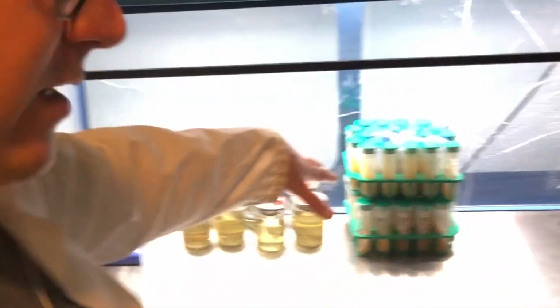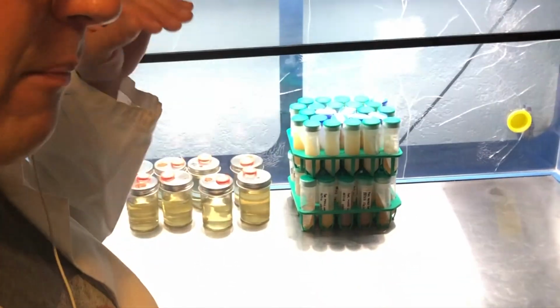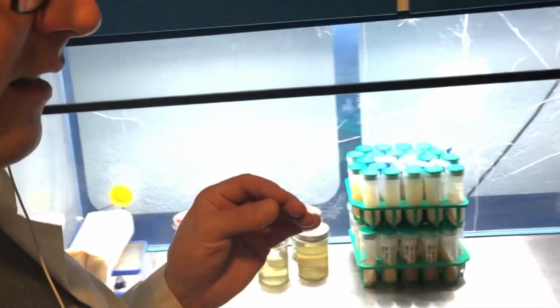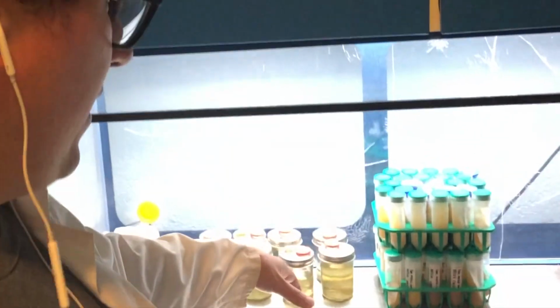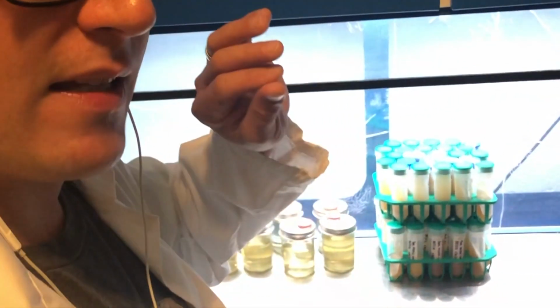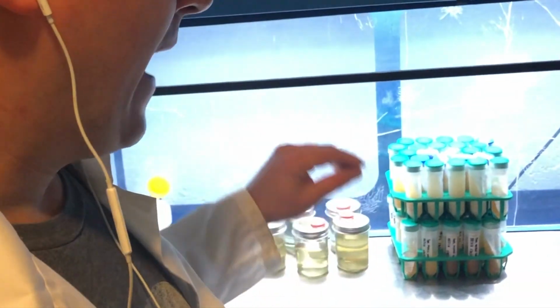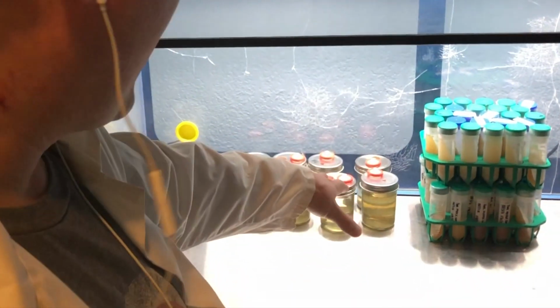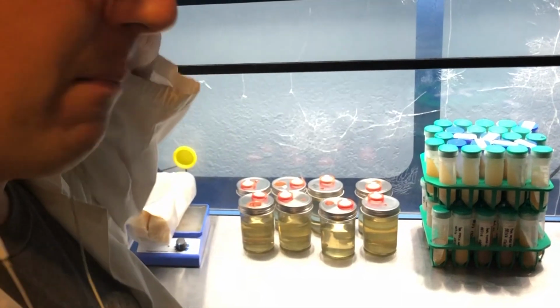This kind of goes against what I usually say, because normally I would pour my plates before I work with sterile tissue, because that's the cleanest process first. But this is the end of last week, so I'm going to finish this up, and after I'm done with this process, I'm going to really clean out my hood, and then I'll be pouring my plates. So I'll go through my inoculations using my slant cultures over here, and then I'll clean my hood out, and then I'm going to be pouring plates.